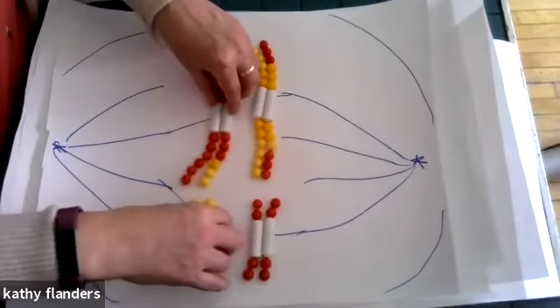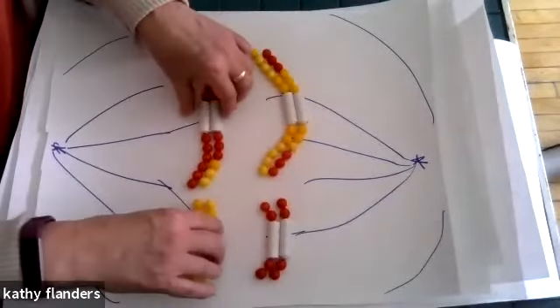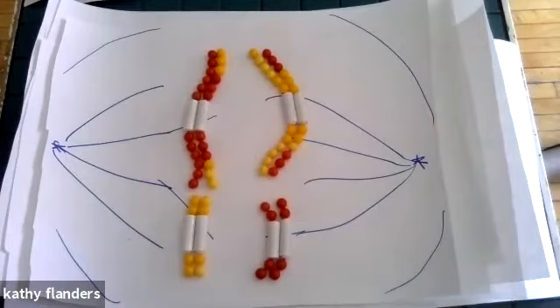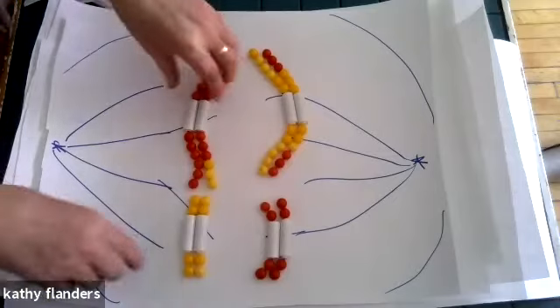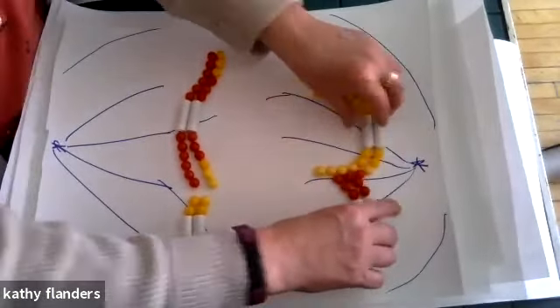And what's our next? We're after metaphase. These two start pulling toward the pole. What's that called now? What comes after metaphase 1? Anaphase. Anaphase 1, right? In this case, it's anaphase 1. So these are going to start pulling.